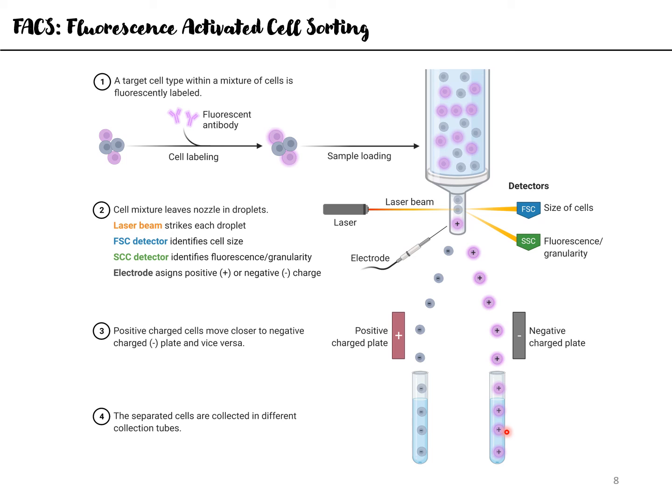So what about the condition we were talking about, where we are detecting multiple epitopes and we have, say, two antibodies present, and each of them is fluorescing a different color, and we want to sort these cells on the basis of two cell surface markers. So the software would be fed in such a fashion prior to the beginning of the experiment.